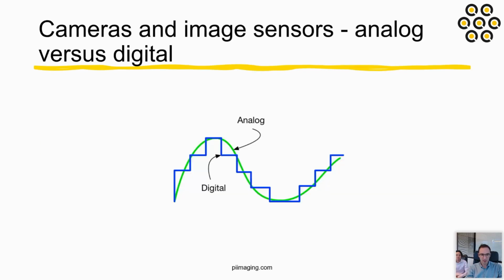So now I will switch more to comparisons between cameras and image sensors. And I would like to reiterate the fact that we are really a digital camera. When I say we, I mean SPADs, so deep is my connection with SPADs, compared to other analog sensors like CMOS, scientific CMOS, EMCCD, and also ICCDs.